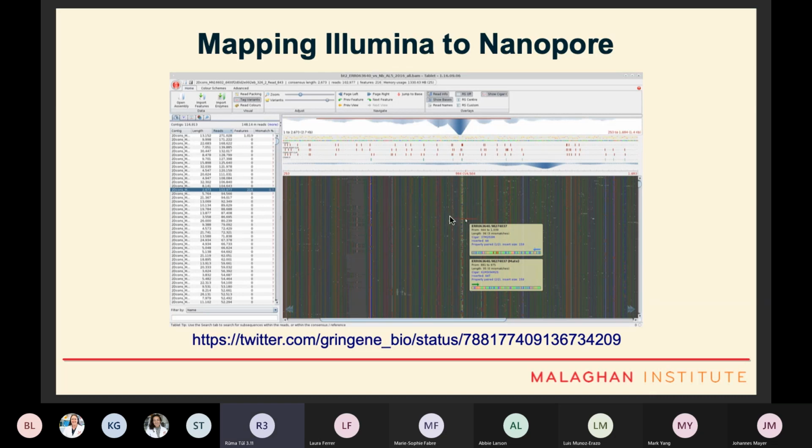The mouse cursor here in this image is highlighting a single one of those Illumina reads as a red horizontal line, which represents a single sequence that came out of the sequencer. And other sequences are piled up on the top and beside all around there, so that it's possible to work out how many times an Illumina sequence matches the nanopore reference sequence that I'm interested in. The bases in the reference nanopore sequence appear in this plot as vertical lines, but you don't see all of the bases. It's difficult to see individual bases at this scale.